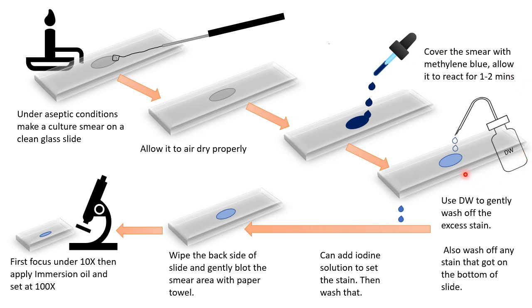After the staining time, wash off the excess stain using distilled water. You can use a wash bottle or wash it under running tap water, but the stream of water should be very low. Use distilled water to gently wash off the excess stain. Also wash off any stain that got onto the bottom of your slide, because that may interfere with your image when observing under the microscope.